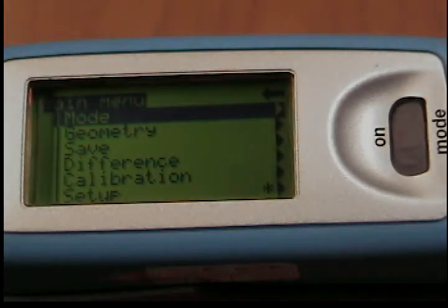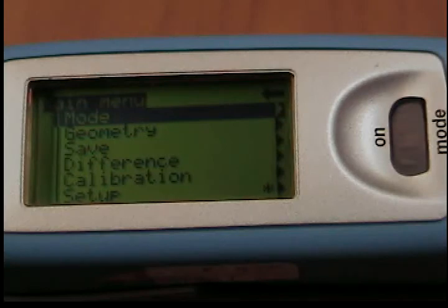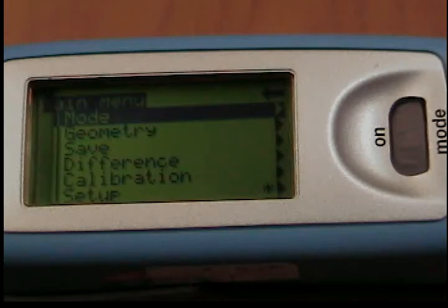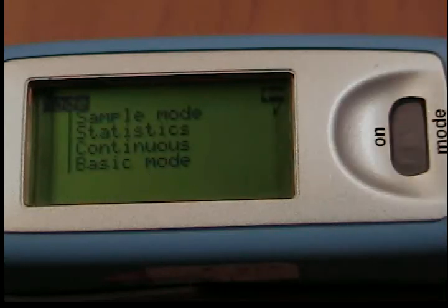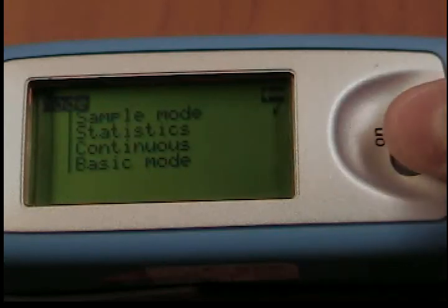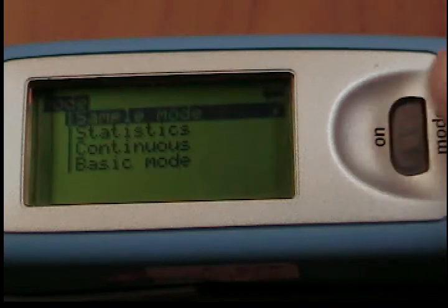Certain rules apply within the menus to make it easier to navigate. A black triangle to the right of the function indicates that selecting this function will take you to a submenu. A check mark on the right indicates that the function in question has been activated.